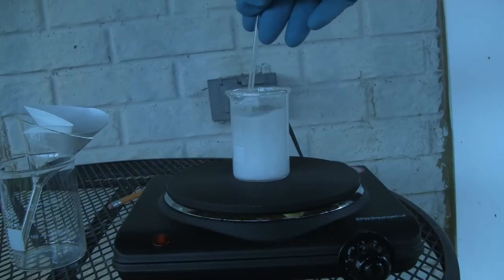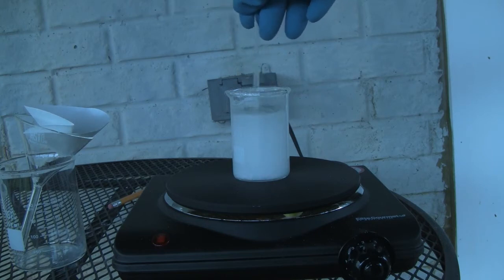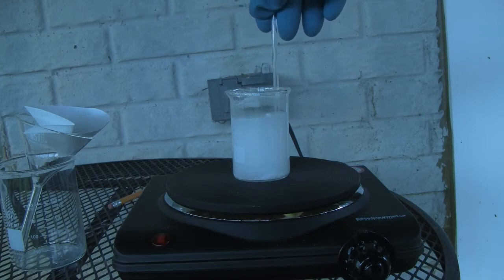Once ground finely, the powder is then added to a beaker alongside 65 milliliters of acetone and then stirred. The mortar and pestle was then also washed with some acetone and then added to the beaker. The solution is heated for a few minutes to dissolve as much ASA as possible.